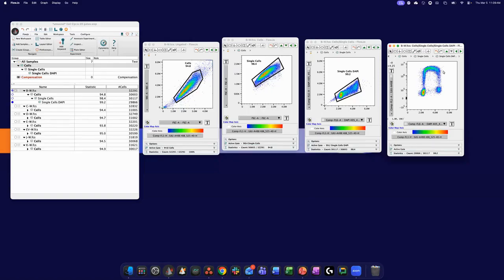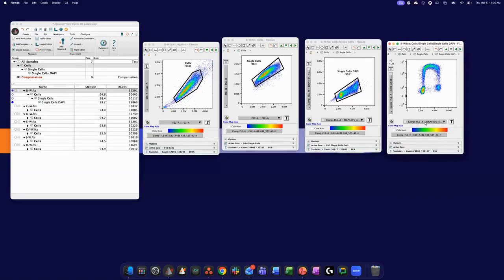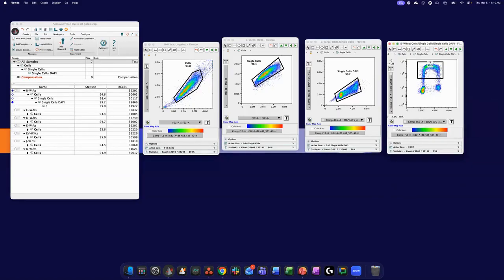Okay. And then here's the key plot that is of interest. We're looking at DAPI versus the EdU, based on DNA content alone: around 2 million for the G1, closer to 4 for the G2M, and then we have the EdU stain for the synthesis. Now, normally you would just have to do manual gates here. I could take a rectangle gate and come in and start identifying these things. So that would be the S phase, and this would be the G0, G1, something like that.